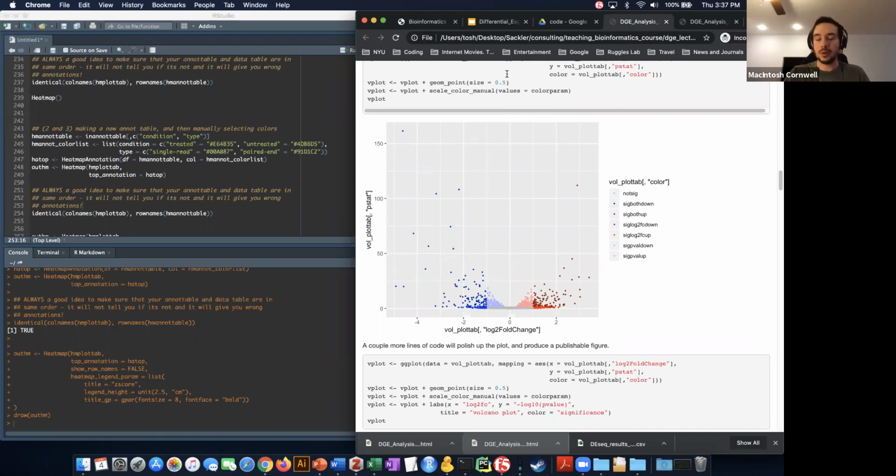There's one which is essentially just an enrichment of the genes that belong to certain sets. This is based off of what's basically just called a hypergeometric test. You're essentially just looking for an overrepresentation of genes belonging to an individual set. As in, if you have 50 genes you're interested in and 20 of them are all part of the coagulation pathway, well, that wouldn't happen by random chance. So there's a good chance that something's happening in the coagulation pathway.